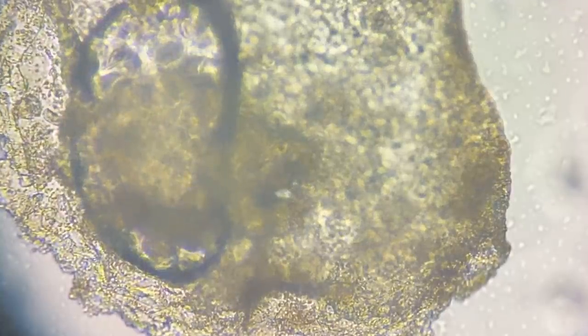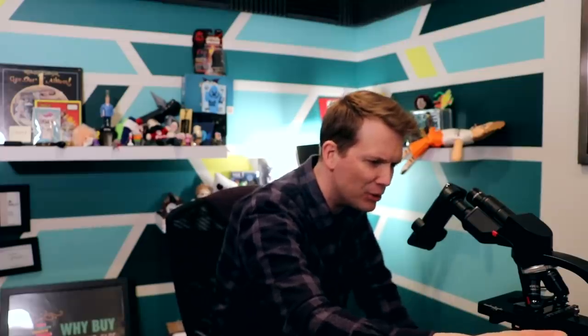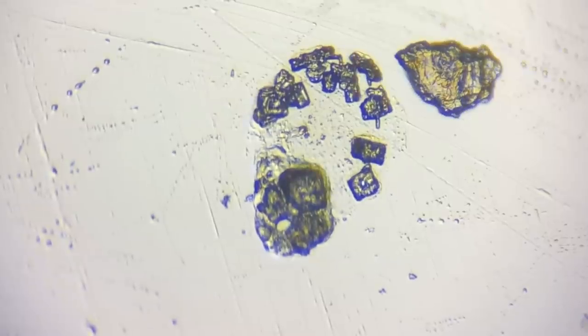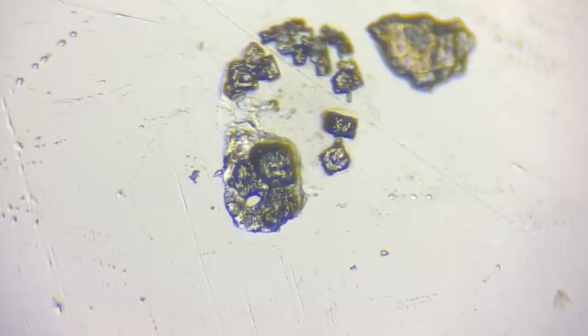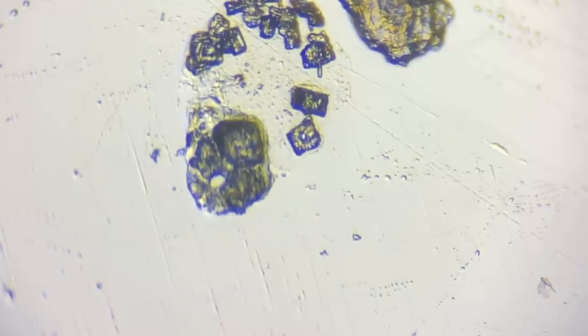I'm so sorry to everyone in my family for never cleaning my glasses. And I'm so sorry to all of you for subjecting you to my face boogers. A similar story on this other lens — skin cells aplenty, just flakes of skin, occasional threads and hairs, and lots and lots of globs of oil. Those are salt crystals, I think. They look too rectangular to be organic — a drop of sweat that dried up, maybe. That's kind of cool. I hate it! It's like the frickin' surface of Mercury up in here.